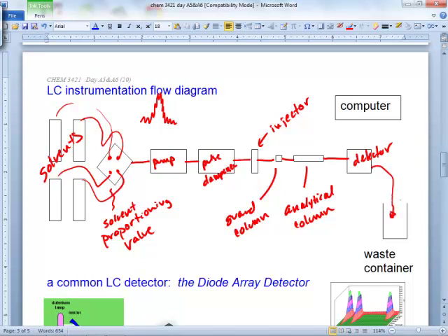So if you wanted to collect the stuff, instead of having a waste, just put in a little test tube or something. You actually collect pure components. We did that for this scorpion project out here. We collected the compound that causes scorpions to fluoresce.